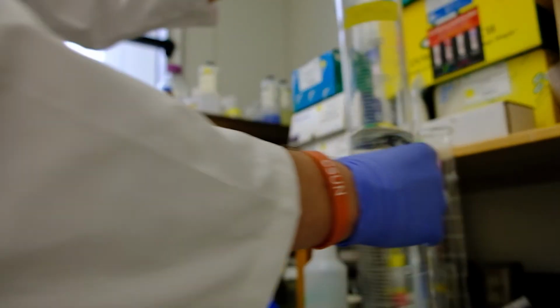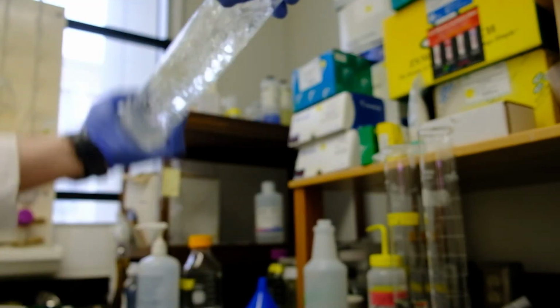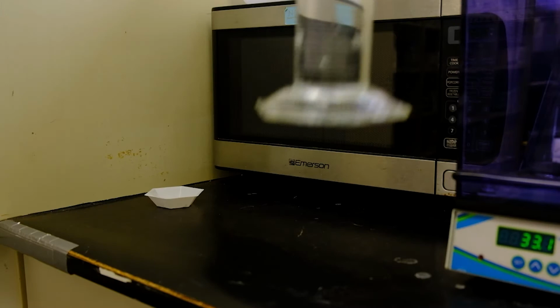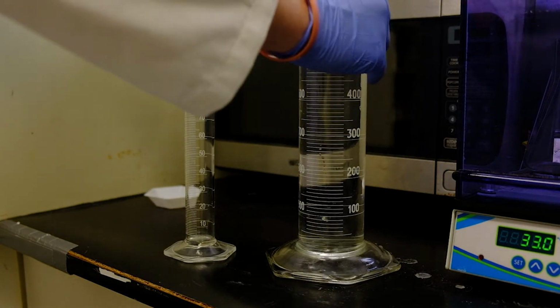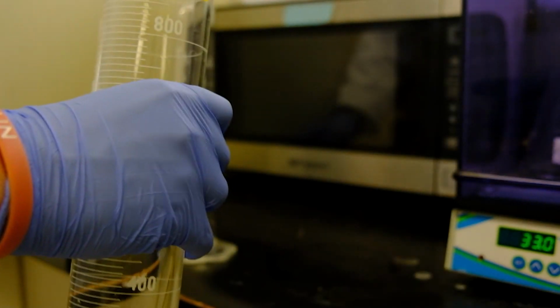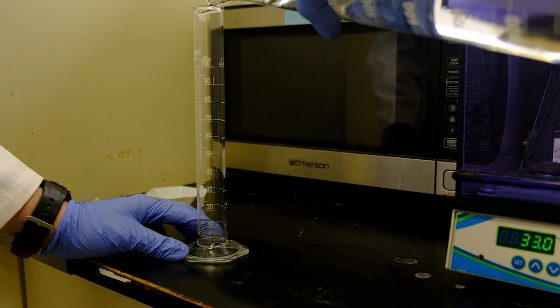TAE buffer tends to precipitate over time, so make sure you mix it up. I usually just invert the vessel. Prepare your measuring glassware. Measure out the right volume of a TAE buffer and have it ready.